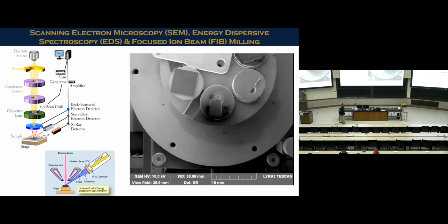And how to do this? So we turn now to microscopy techniques, to understand. So the electron microscope is another type of accelerator, except that you are generating electrons, and you're shining electrons with these electromagnetic lenses on the object, and then you generate secondary electrons, which you can use for imaging purposes. And there is also a possibility to do elemental analysis using this technique, energy dispersive X-ray spectroscopy. In addition to this, we also have the ability, which is nice for these objects, to do micro-destructive analysis.